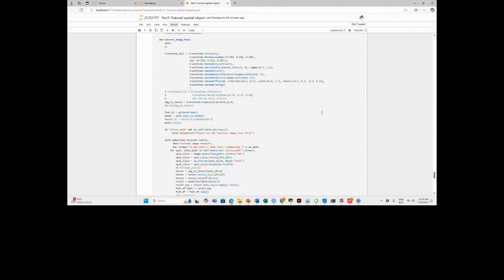So Mauricio, there is going to be some error. If Carla uses the biggest cell, we know that our cell is much smaller than the biggest cell, depending on the cell type. There is some error. However, it's an approximation that we are using. There are better ways to do this, but at this moment is what Carla did.